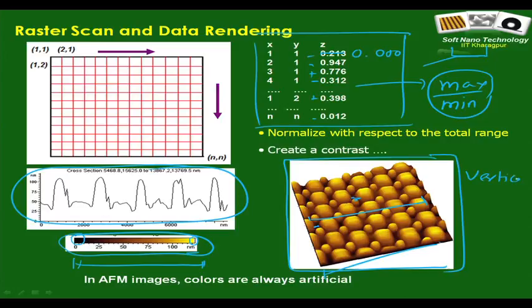So, this is an outstanding capability that only your atomic force microscope can offer, and it can offer because it does not image or take a picture of the surface. It actually visits, the probe actually visits every point and picks up the information how much elevated or depleted that point is with respect to the point where the tip had initially approached.